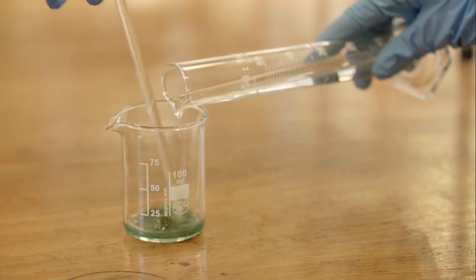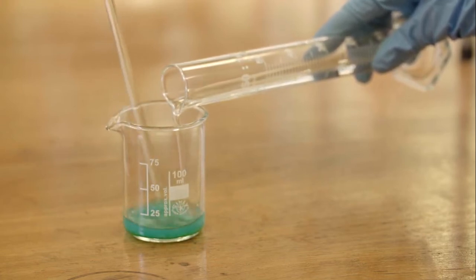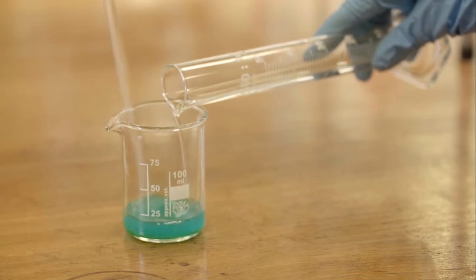The mixture is gently stirred with a glass rod until all the solid dissolves, forming a blue-green solution.